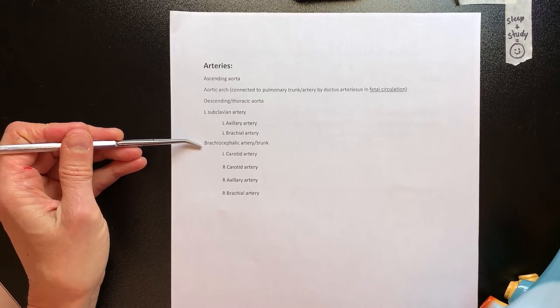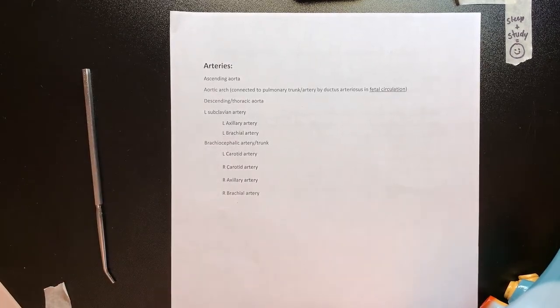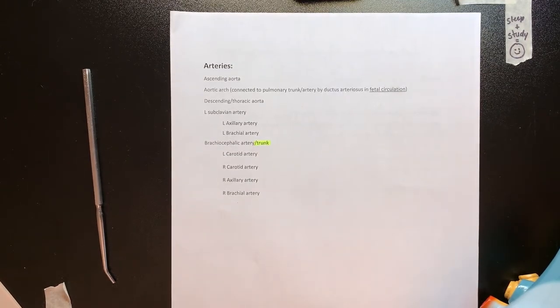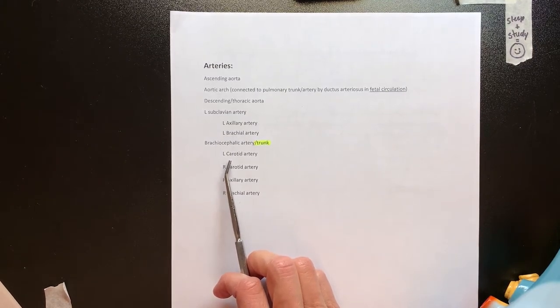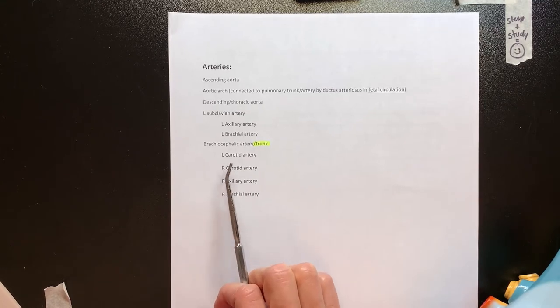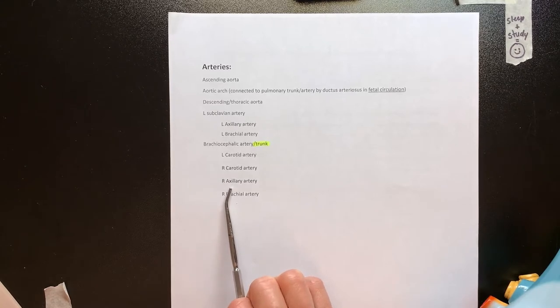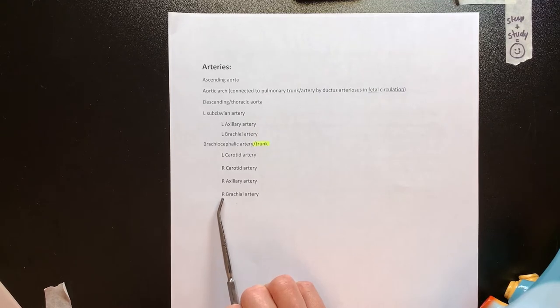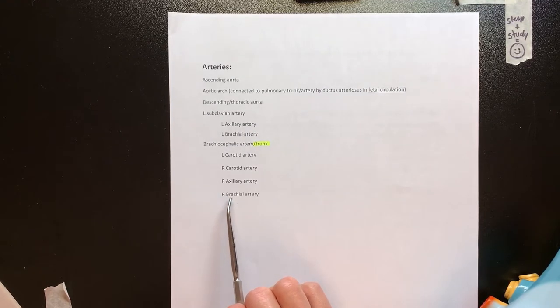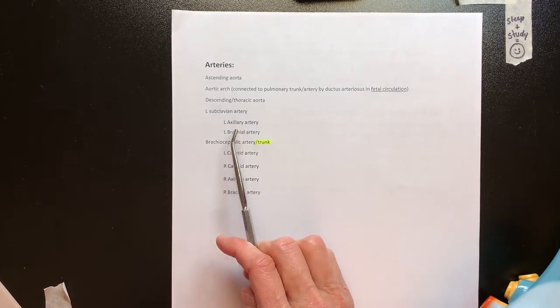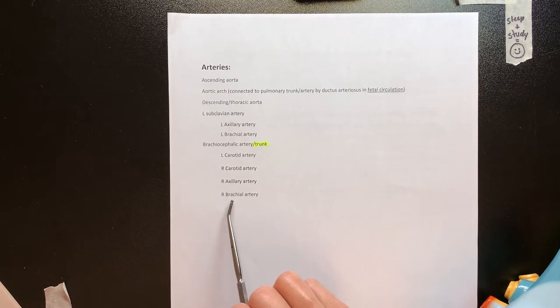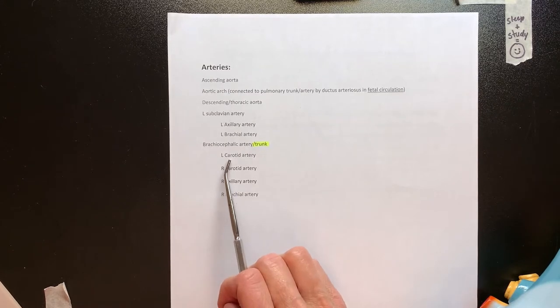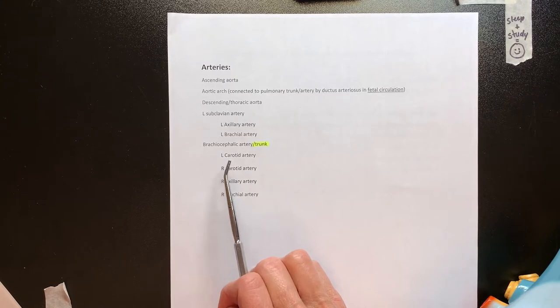Then we'll have a brachiocephalic artery or trunk — and it's important to associate the word trunk with branches coming off of it. In pigs, the brachiocephalic trunk covers both of the carotids: the left common carotid and the right common carotid. Then we'll have the axillary artery and the brachial. You'll note comparisons between the veins and the arteries here — they both have brachial and axillary branches. The difference is where the common carotid runs with the internal jugular; now we'll see the carotid arteries.